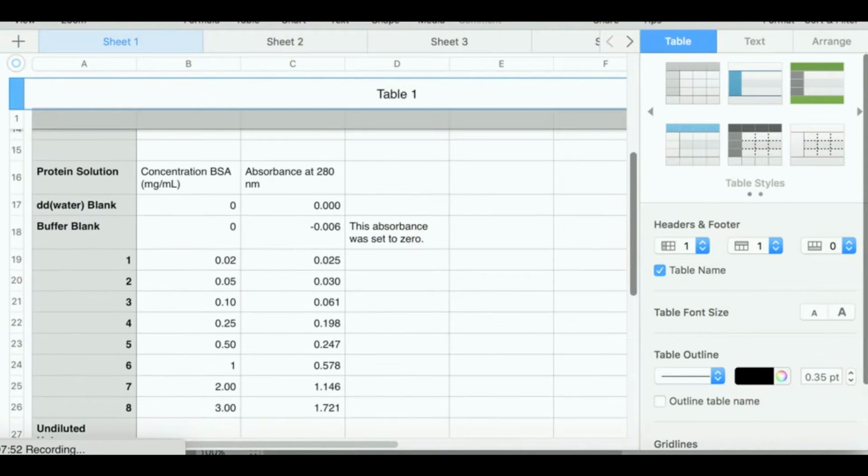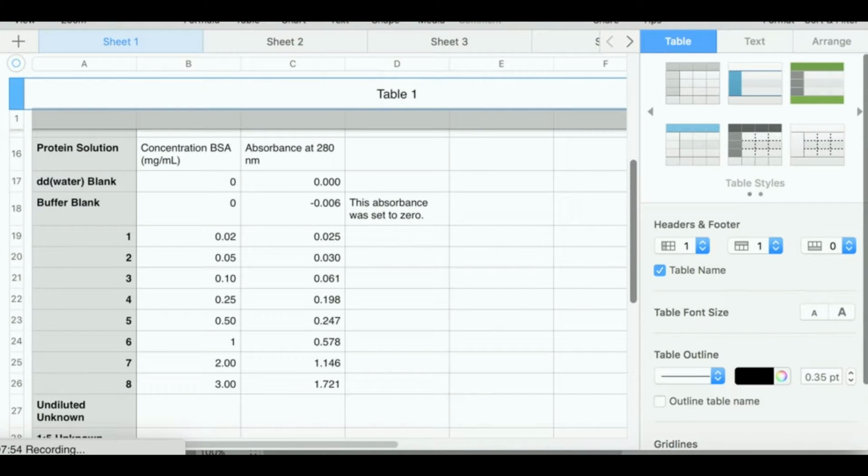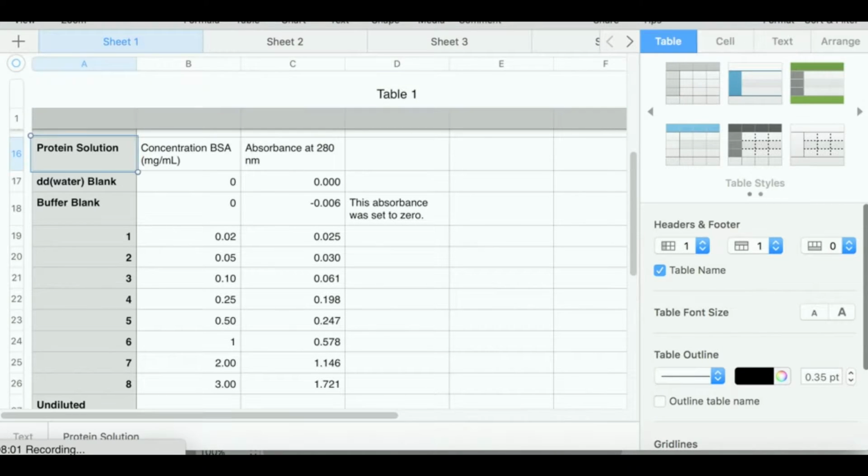All right, so here's my data from actually a lab that I did, okay? This is a lab I did in the biotechnology master's program. What I was measuring in this lab is a protein called BSA. That's called bovine serum albumin. We actually have a form of albumin, but this is bovine. It's from cows. And it had some concentration in milligrams per milliliter. It turns out that BSA absorbs at about 280 nanometers, which is in the UV part of the spectrum.